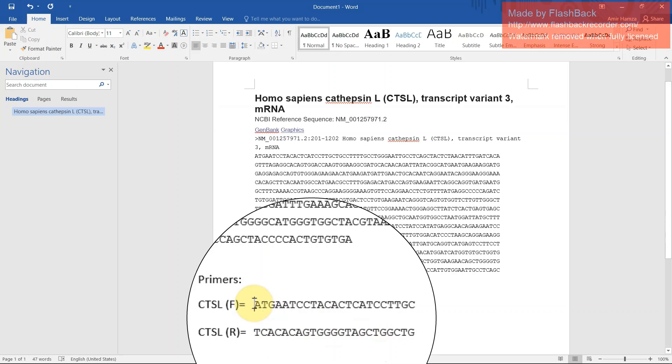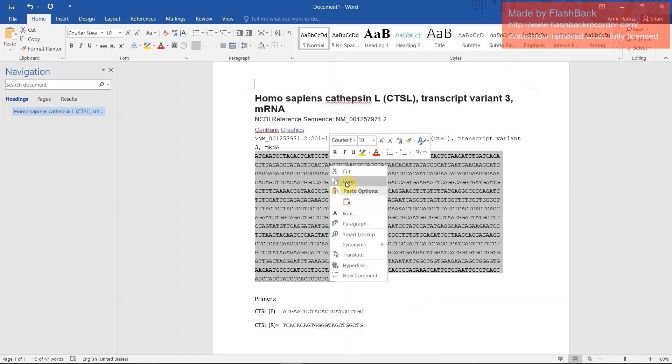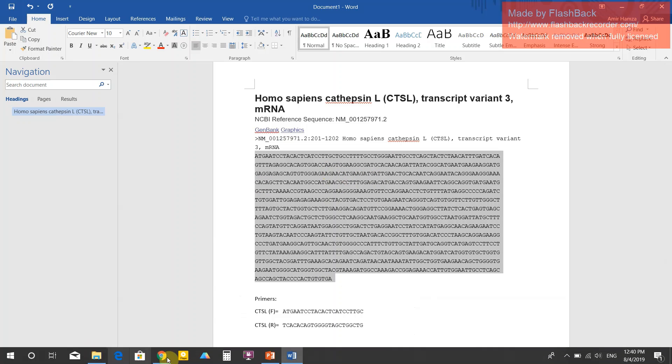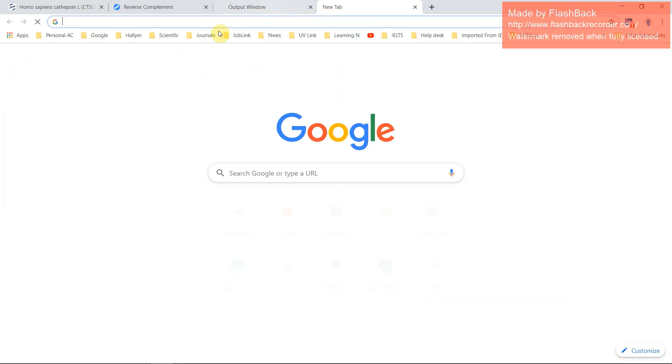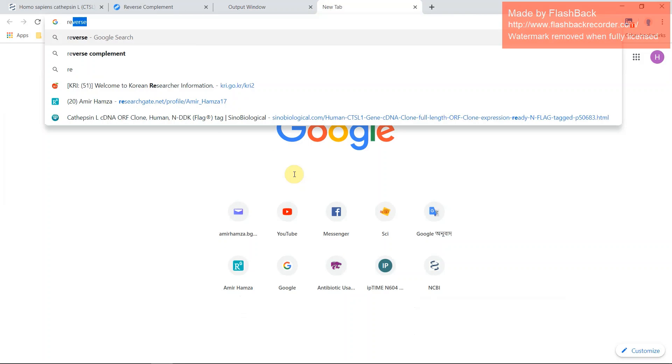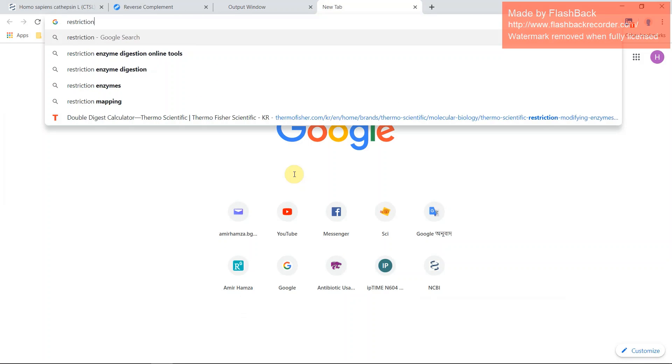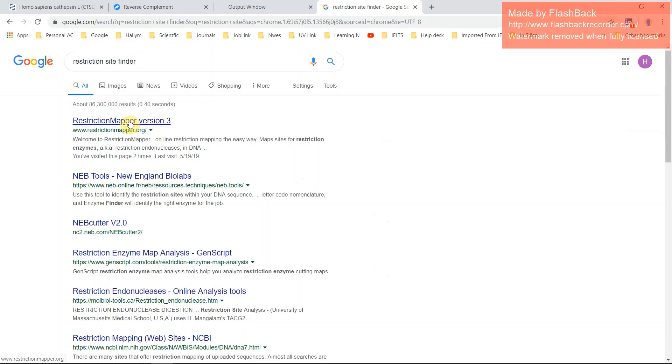This is not all. You have to add here your restriction site and extra 3 nucleotides. I will show you how will you take your DNA restriction site. Just copy your DNA and again go to the browser, just search restriction mapper.